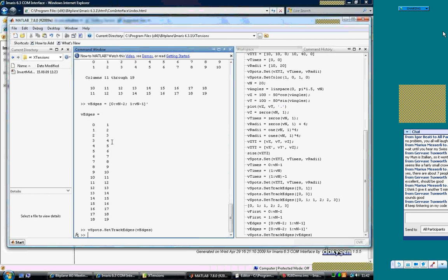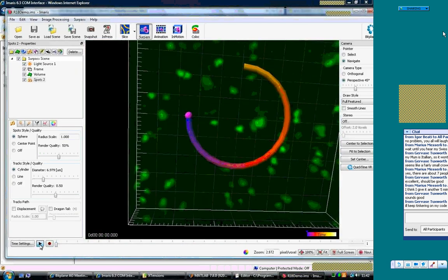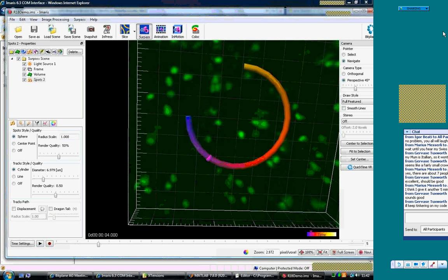So we can run our animation and set them. And so now that's it for the tracks.